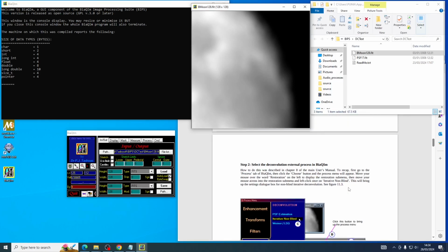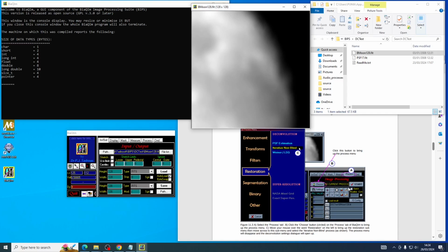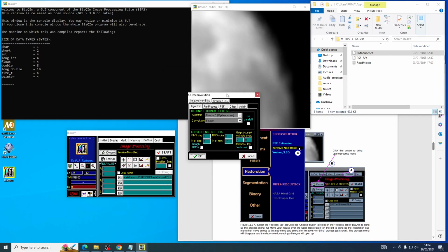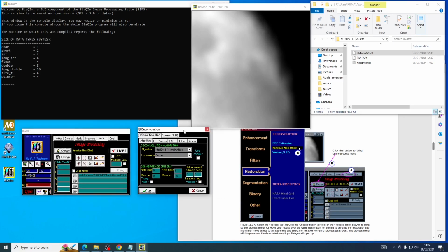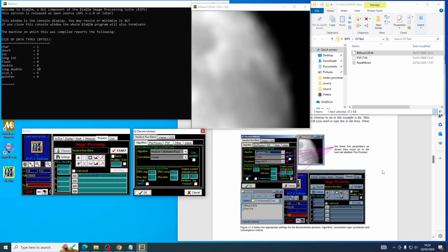And the next step on the step-by-step guide is to choose deconvolution from our process tab. So we go to the process tab on BiaQIm like this. We go to choose and you select restoration, iterative, non-blind. Click on that. We'll give you the settings tab for the iterative, non-blind deconvolution. The next step, as we see on the guide here, is to select the settings for the type of deconvolution we want.